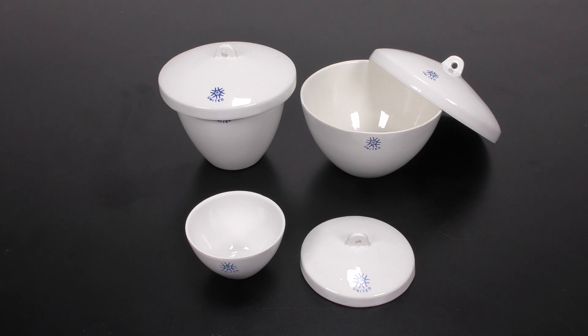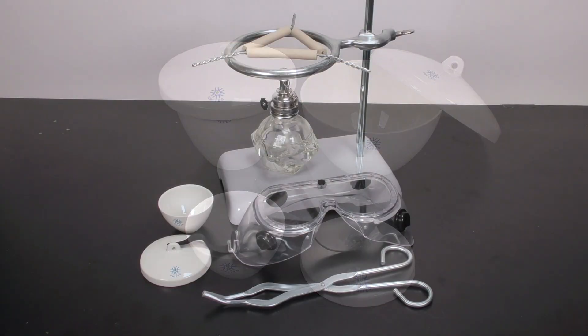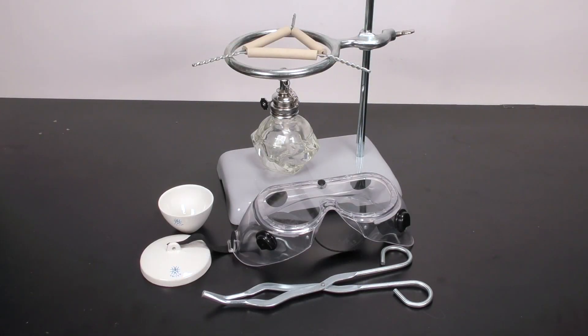These come in a variety of different sizes. In order to use a crucible safely, you need some other materials as well. You'll need a support stand, a clay triangle, a support ring, a burner of some type, crucible tongs, and safety glasses.